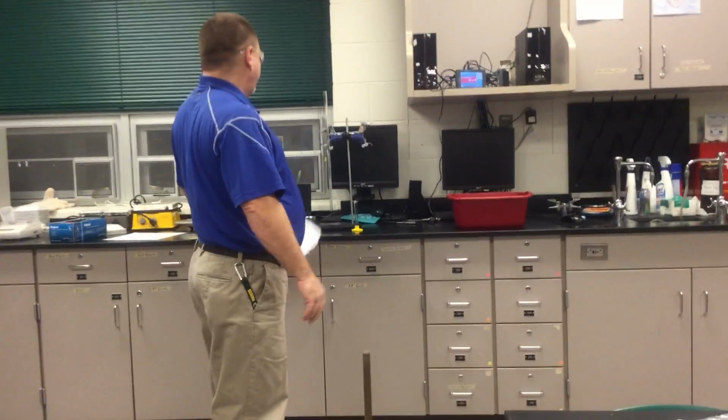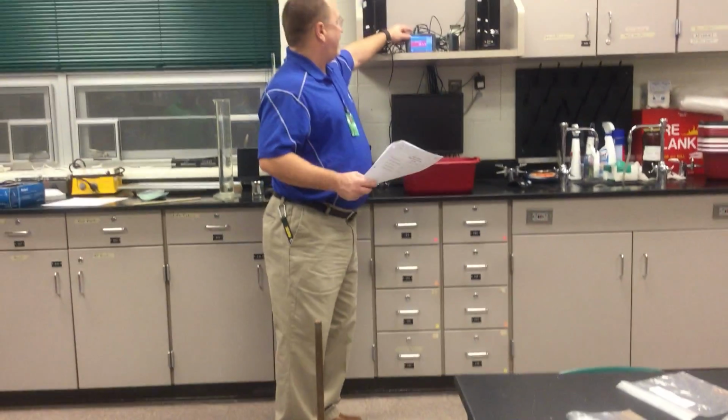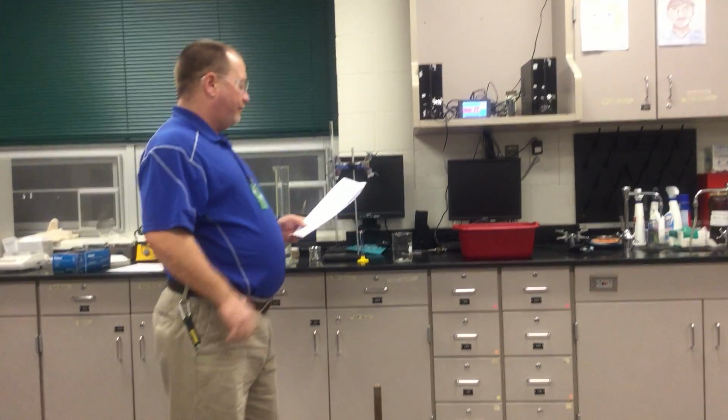Okay? The very first thing that it says to do is to plug in a temperature probe, which I have plugged into my LabQuest right here. It is reading 20.1 degrees Celsius. Don't put that down yet, because that is not the temperature that you're going to use. That is room temperature right now. And it says right there, it should be somewhere between 20 and 25 degrees Celsius. So we're going to monitor the temperature of the water in the collection beaker as this reaction's happening.